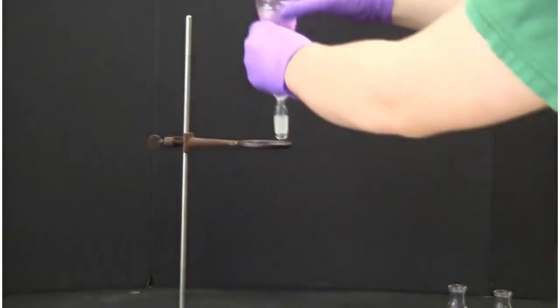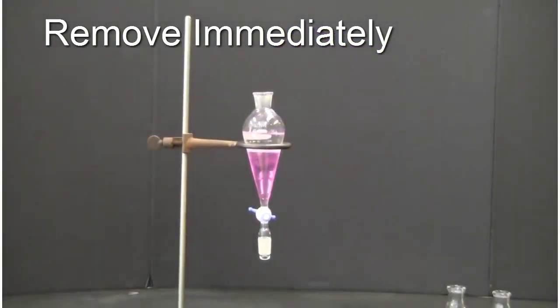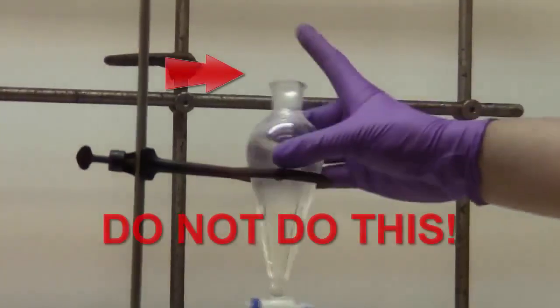The funnel is then placed back in the iron ring and the stopper is removed immediately to prevent residual pressure buildup from ejecting the stopper and solution.